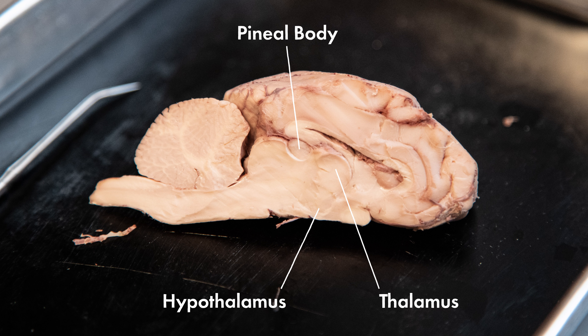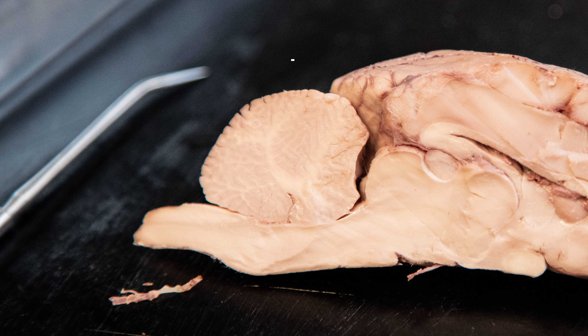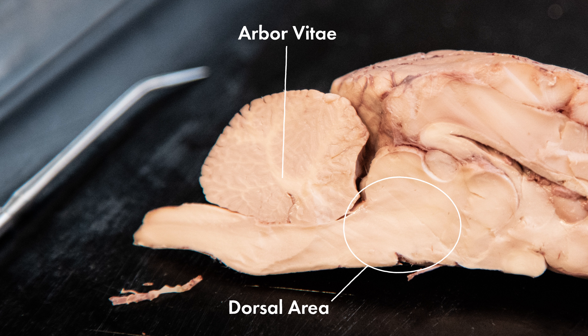Let's move on to the cut surface of the cerebellum. In the medial section, there is the white matter of the cerebellum that forms a branched tree-like pattern called the arbor vitae. Here between the thalamus and the pons, there is an area that contains important nerve tracts called the midbrain. This area is concerned with responses to visual and auditory stimuli.